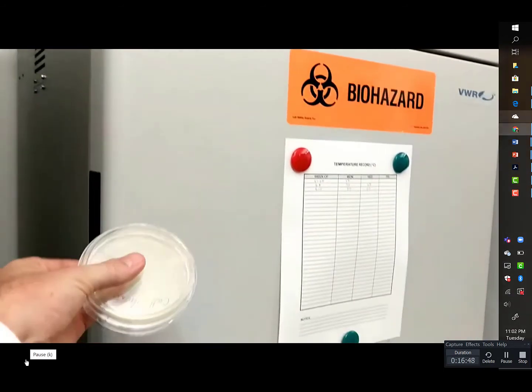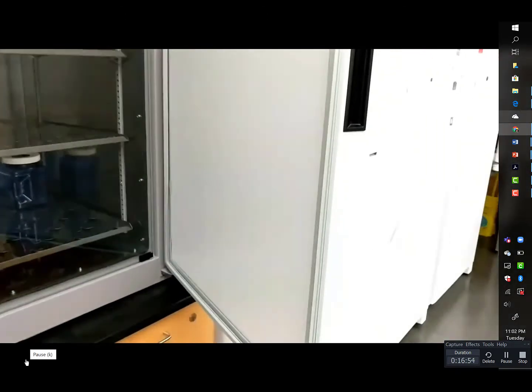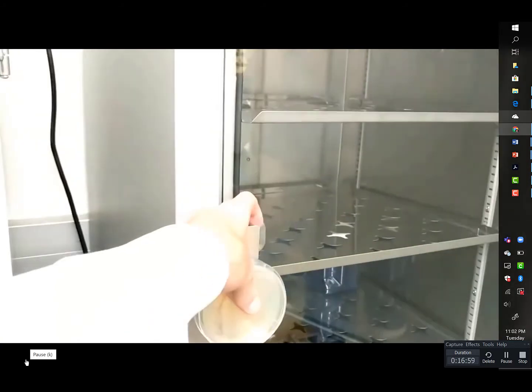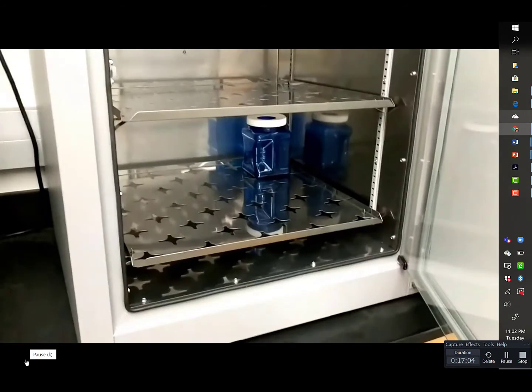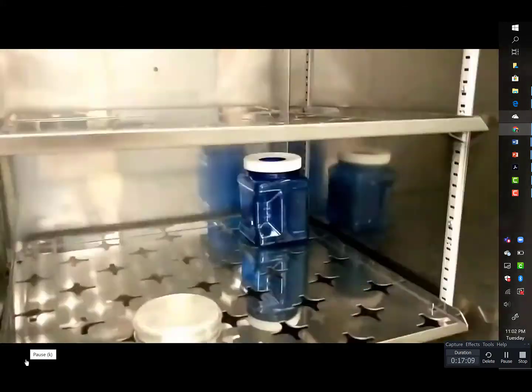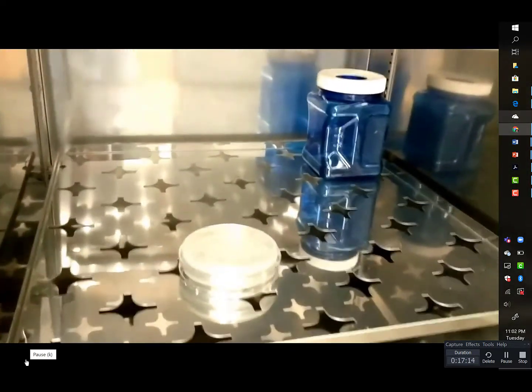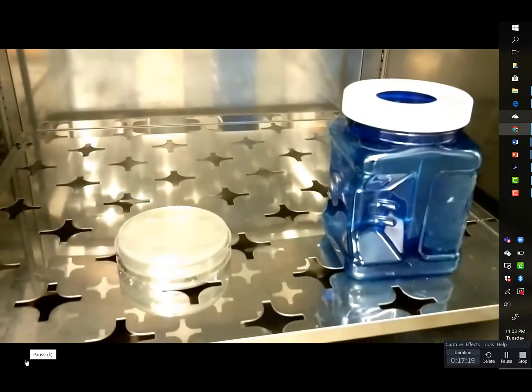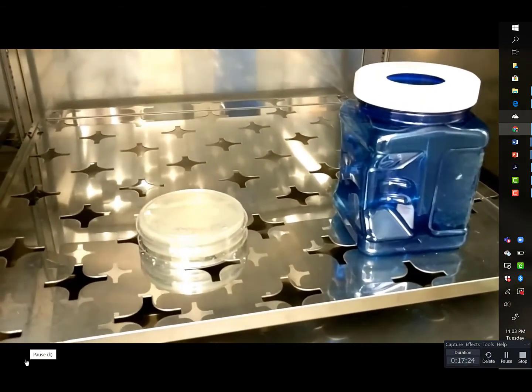And so what we're doing is taking the stack of plates, and we open up the insulating jacket, and there's an inner glass door that will help to seal in moisture. In fact, we can put our stack of plates here, but we can also look down in here and see that besides our plates that we're incubating upside down, there is a source of water, just a little bit of water in there, and that can evaporate over time and keep it nice and humid inside the incubator.